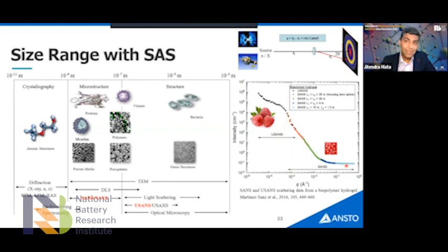This range is really impressive. There are not that many small angle neutron scattering instruments in the world which can go that far into low Q. That is impressive in itself, but you can combine that with USANS. USANS provides information from 100 nanometer, depending on how quickly your sample hits the background, all the way to 20 micron. So if you combine these, it's an amazingly bigger Q range.